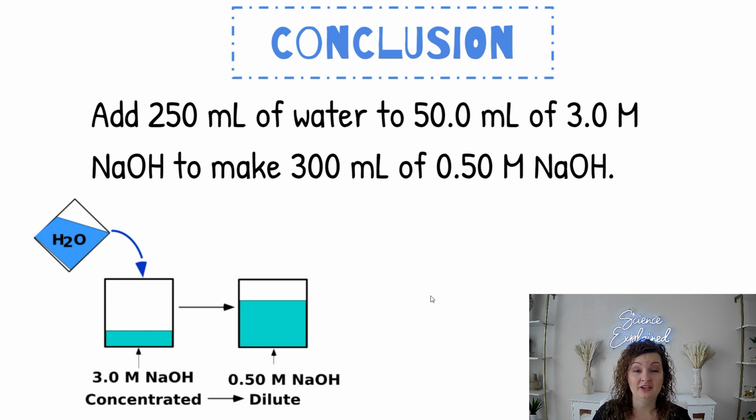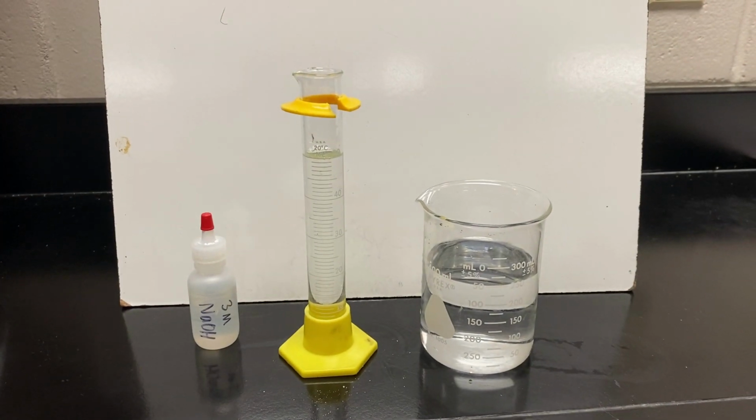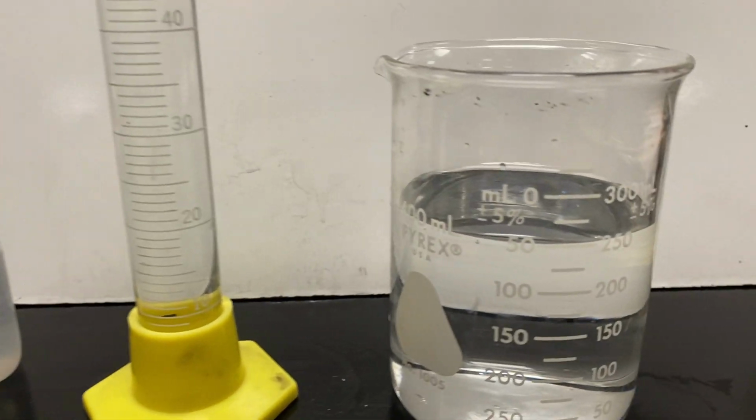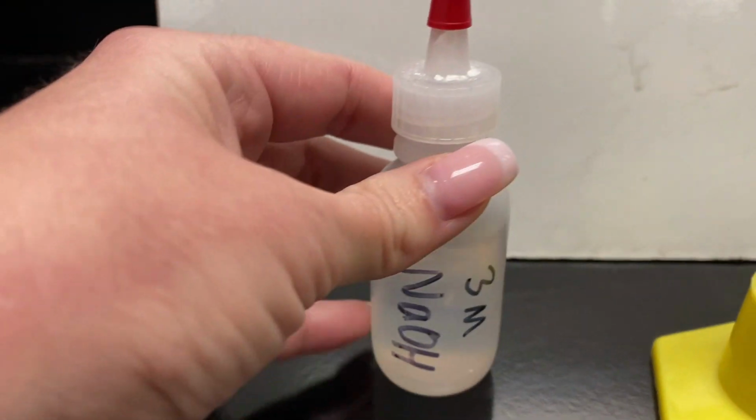I went ahead and did this in a lab for you guys, so let me show you what it looks like now. All right, so here's my lab setup. You can see that we have our 250 milliliters of water, and then over here we have 50 milliliters of our 3 molar NaOH.